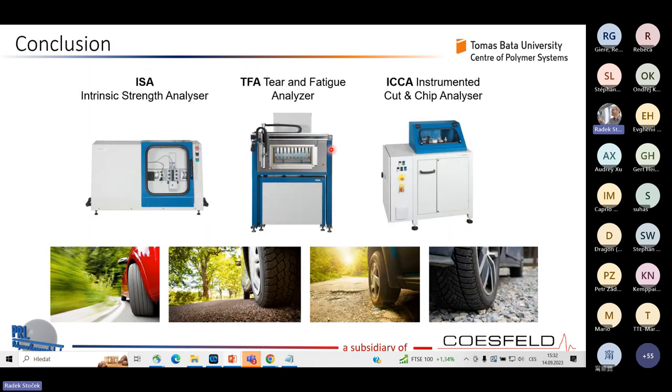So, okay, I will conclude the work, and this will be a very easy conclusion. I tried to demonstrate that using this set of three unique pieces of equipment, we are really able to completely analyze the fracture behavior of material used for tire application. In relation to wear, we can clearly predict the future behavior. Therefore, we can very clearly, on a laboratory scale, predict the future behavior of a tire, and it is possible to enhance the development and save a lot of time and money.